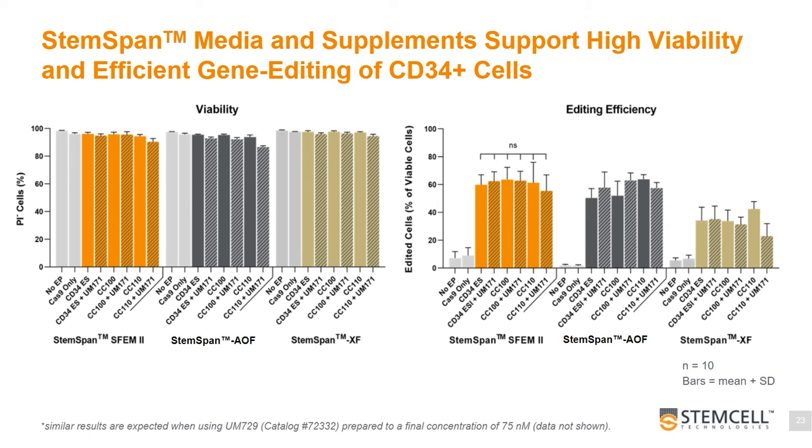Overall, the data shows that all of the tested culture conditions performed similarly across the board and support high cell viability, as shown on the left plot, as well as high editing efficiency demonstrated by the right plot.